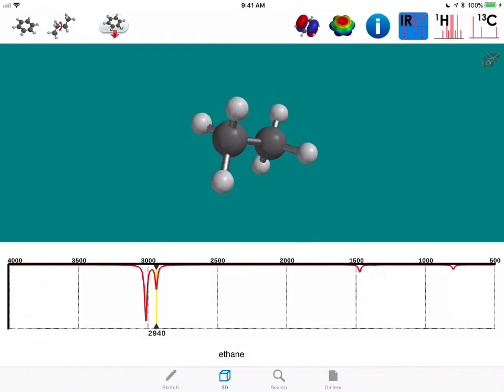For the most part, all organic molecules will have CH bonds and will have these similar modes of vibration. We're not going to be concerned with anything below 1,500 reciprocal centimeters, as that's called the fingerprint region. We're primarily going to be focused on three regions to determine what functional groups are present in a given molecular formula.